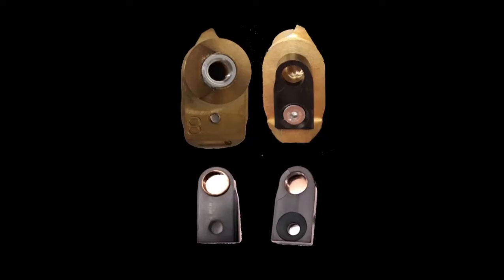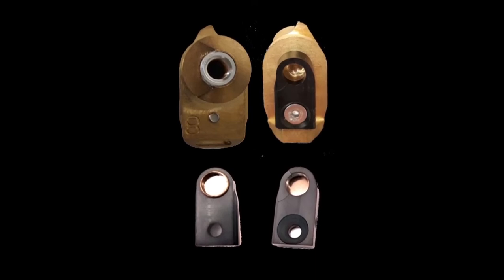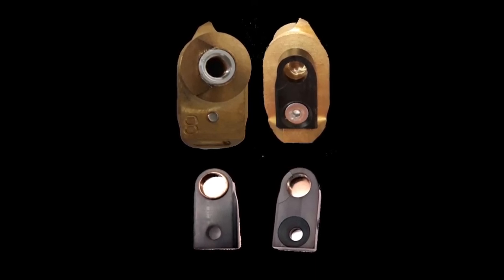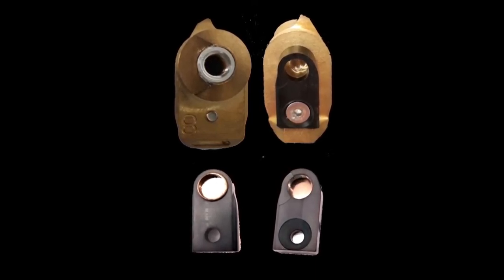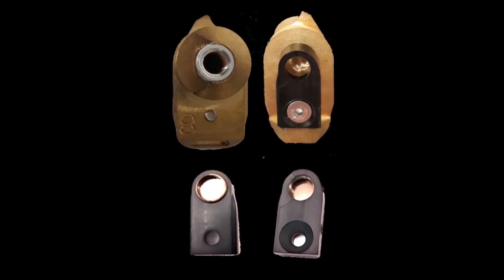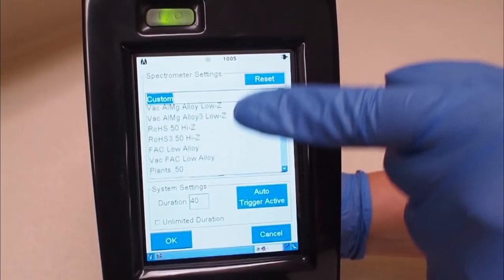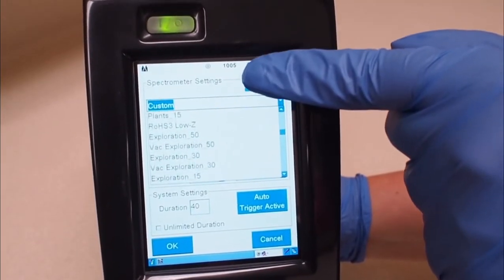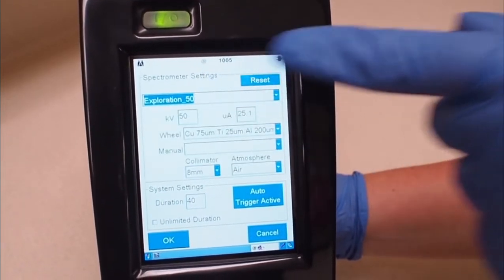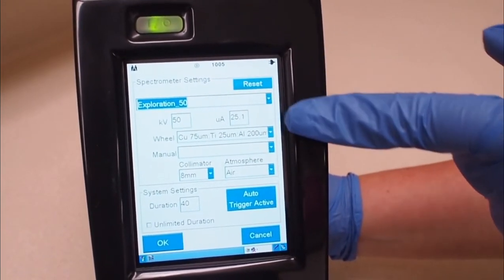Typically, you will find that the filter installed with the collimator will be empty. This is because there is also a filter wheel inside the tracer that is automated and does not require manual handling. These filters are selected when you create your experiment setup.